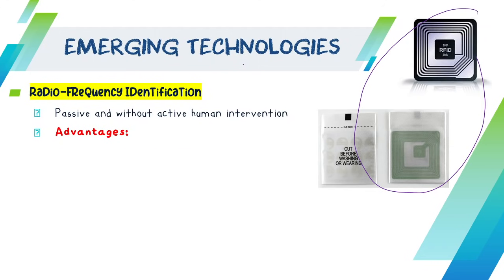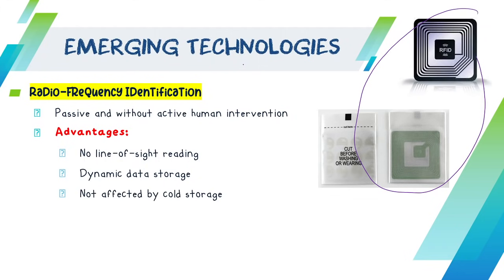So, the advantages of your RFID: no line of sight reading, dynamic data storage, and it is not affected by cold storage. Kaning RFID ninyo, maski na medyo matabunan lang gamay kay walay problema kay it does not need, as mentioned, kana line of sight reading na dapat matutok nato ang scanner dito sa iyaha.